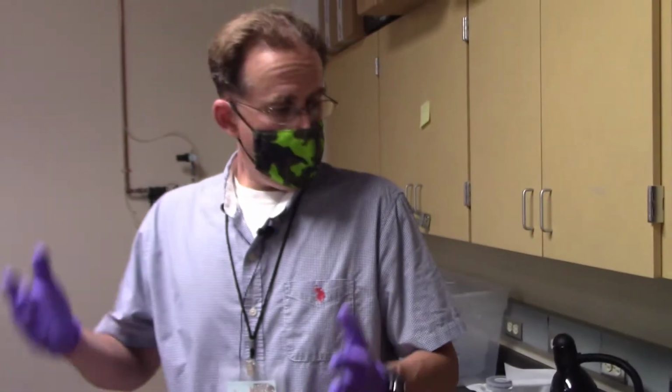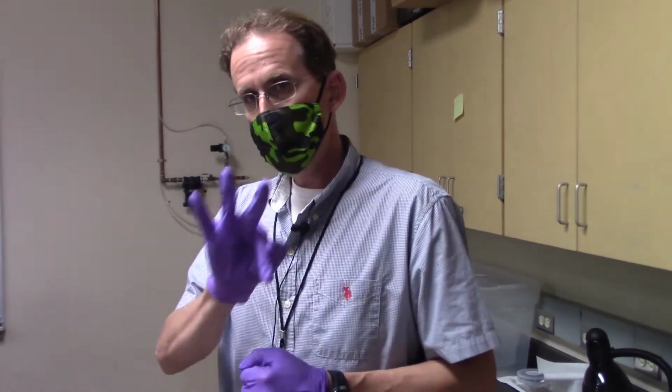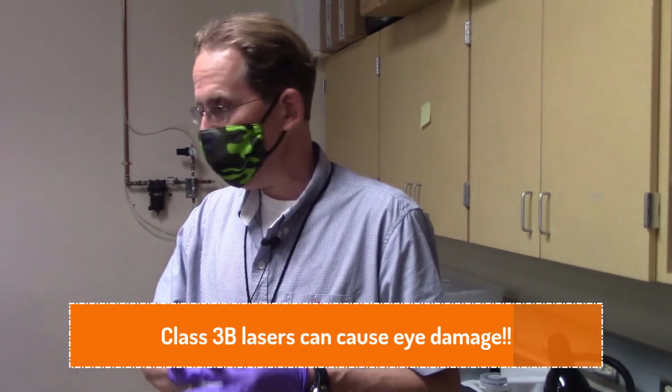All right, so on the Raman system, we like to make sure that we have a safety declaration in place so that everybody understands what's dangerous about this particular unit, and in fact we do that for all of our instrumentation. So what is specifically dangerous about the Raman? The Raman unit is utilizing 3 different class 3B lasers, which can lead to intense eye damage if you're not being careful. What you have to remember about the use of lasers is as follows.